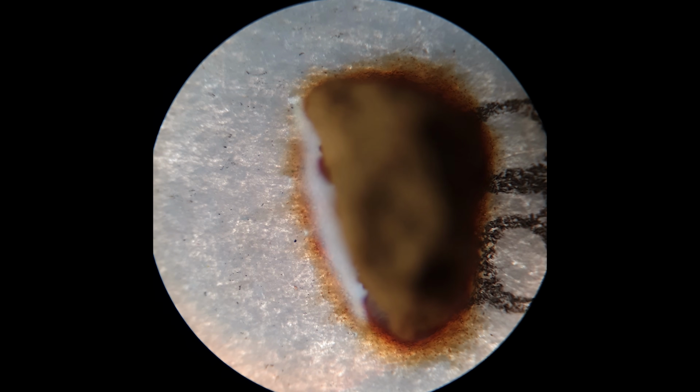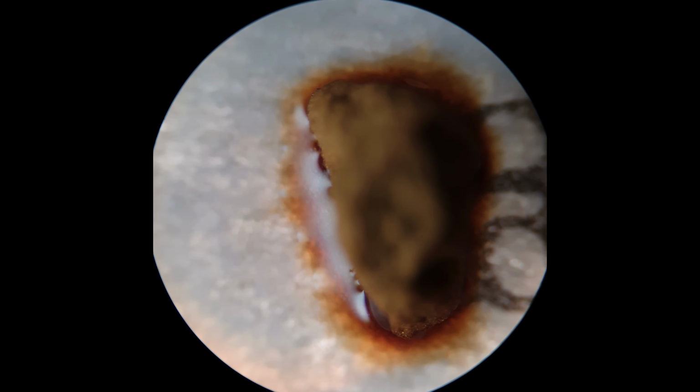And right here we've got a slightly larger granule. And one other thing that you'll notice, you can't really see it here, but you will see it in a moment, is that you'll see lots of bubbles forming. Now if you drink coffee, you'll see often when you pour the water quickly, you'll see a kind of froth or slight foam on the top of your coffee. And that is for the most part carbon dioxide. And that's just a byproduct of when people roast coffee. You can just about see those little bubbles there forming.